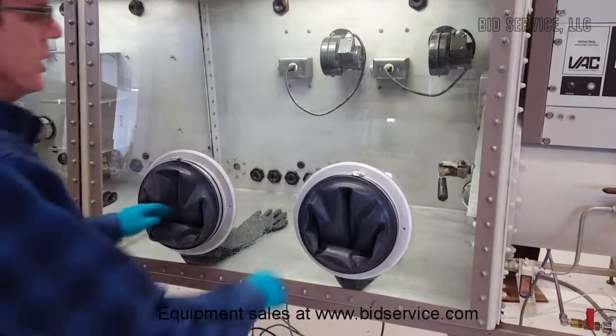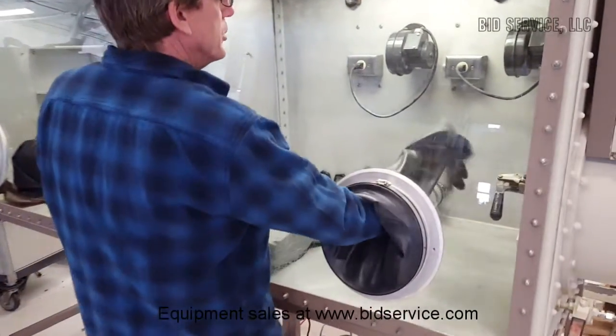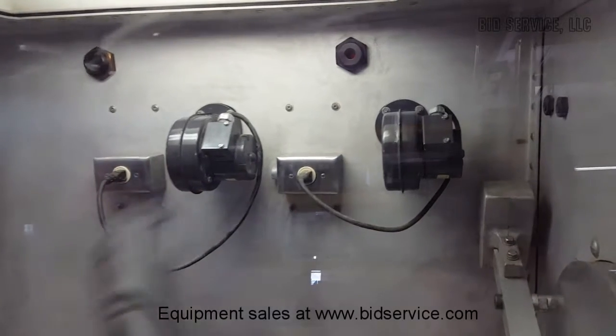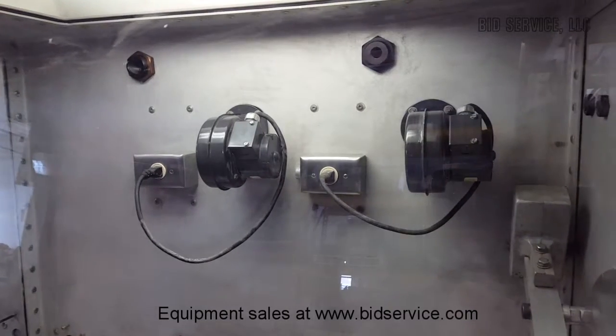Here's our glove box — you can see we've got the gloves and the chambers. We have three circulating blower circulators: one up here, one here, they're plugged in. They blow through the purifier media, which has been replaced on all three of them, and then through this filter and back out.